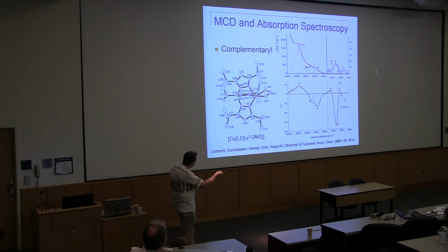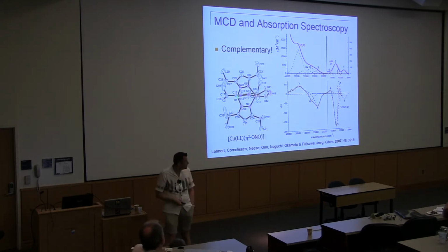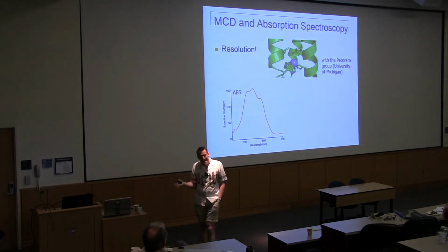You can see the DD transitions now. Some of them are really big, emphasizing this point here, some charge transfer transitions, and then as we go further up, there are inner ligand transitions here, and our MCD intensity kind of comes down. Those transitions have very little MCD intensity. So that's one good thing that MCD can do.